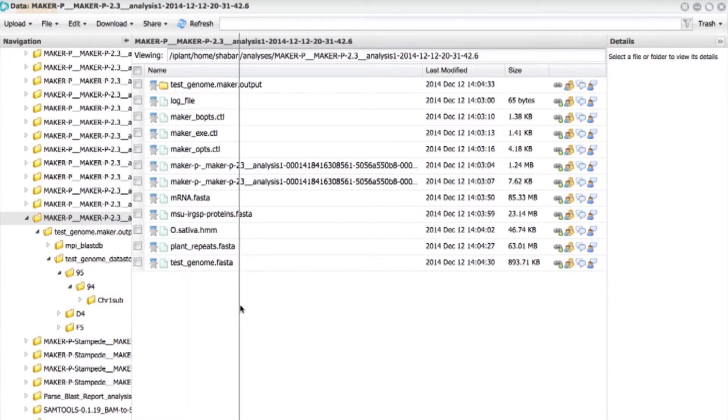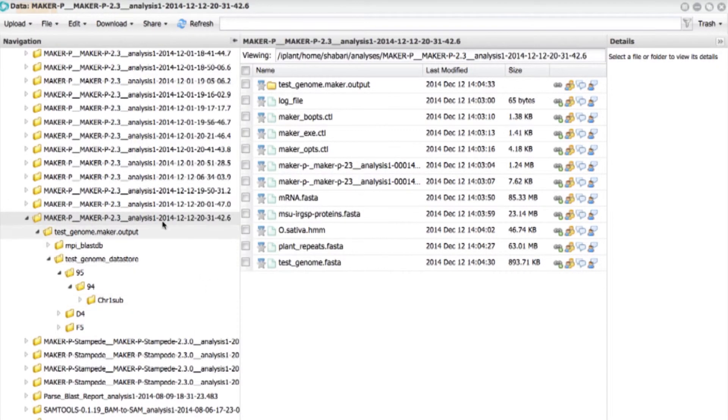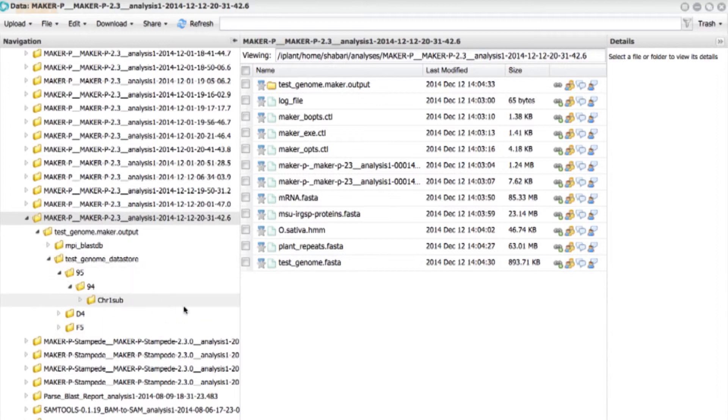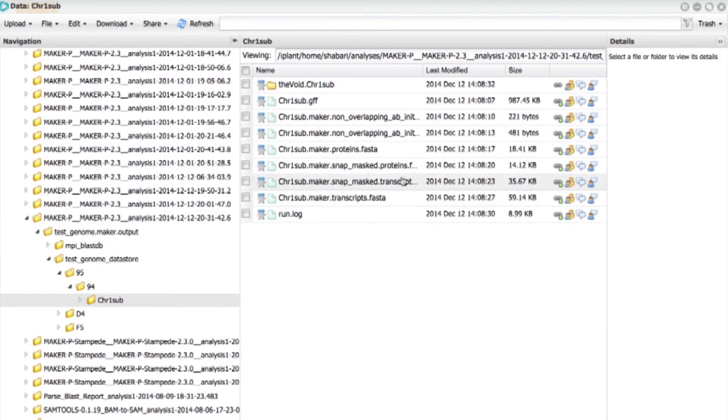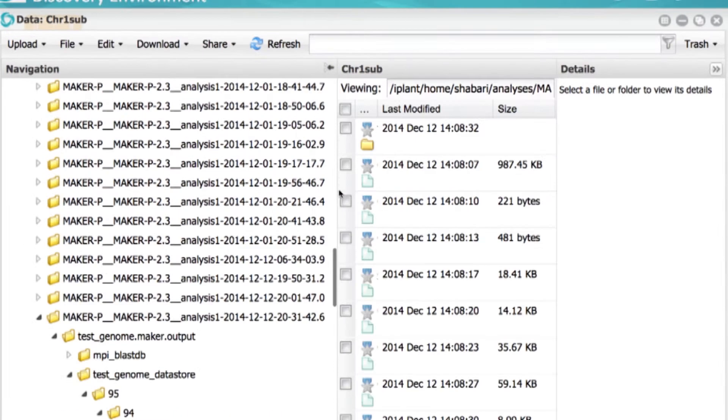So this is the results after the analysis. So if you're familiar with MAKER Run, if you've done any MAKER Runs before, you'll know that the results are organized exactly as you would see it in the normal, as you would have it run in the command line form.